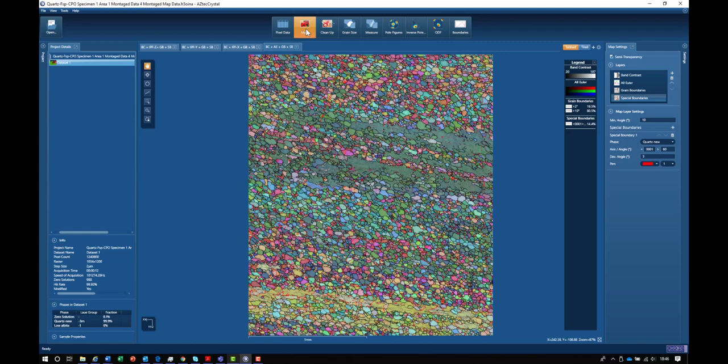This gives us the color scheme that we can see here in this map. We can clearly identify different grains and ribbons in this material that have similar orientations, as shown by the similar colors. But the Euler angles are very difficult to interpret.